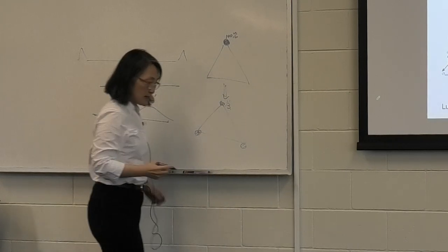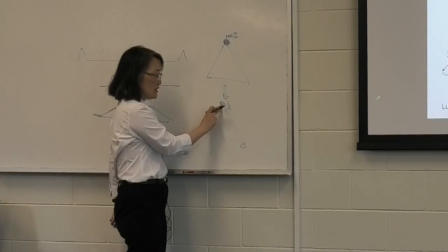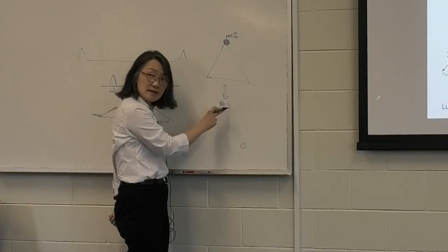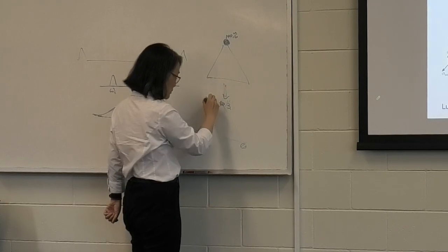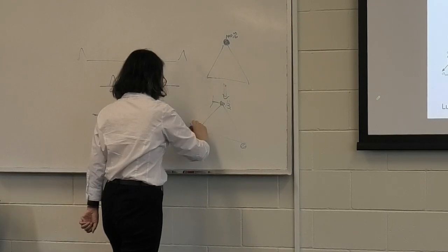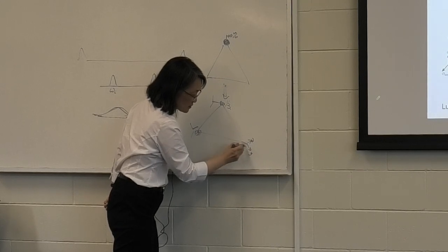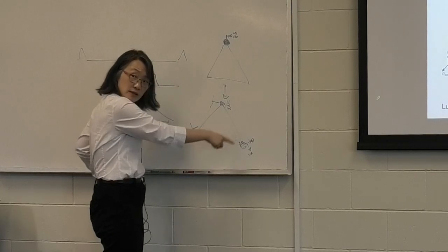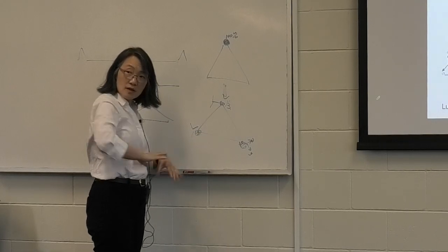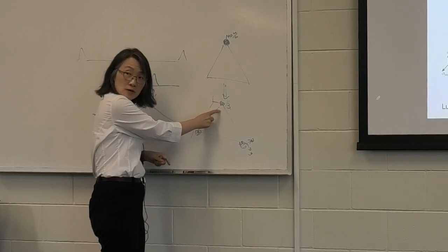And the CSA stimulated echo detects only the amount of the magnetization which stays in the original tensor orientation. Right, so that's the idea. The point is these tensors are differently oriented. This is maybe my Z, this is Y, this is X. So whatever magnetization gets pumped to these orientationally different spins, they don't get detected. My echo only detects the original magnetization.